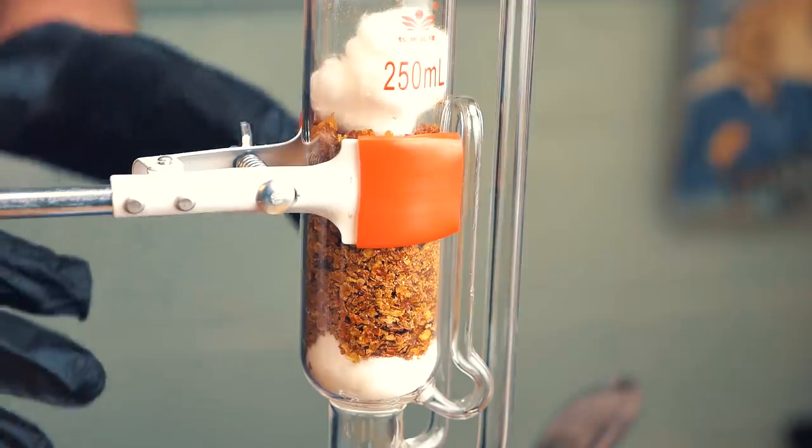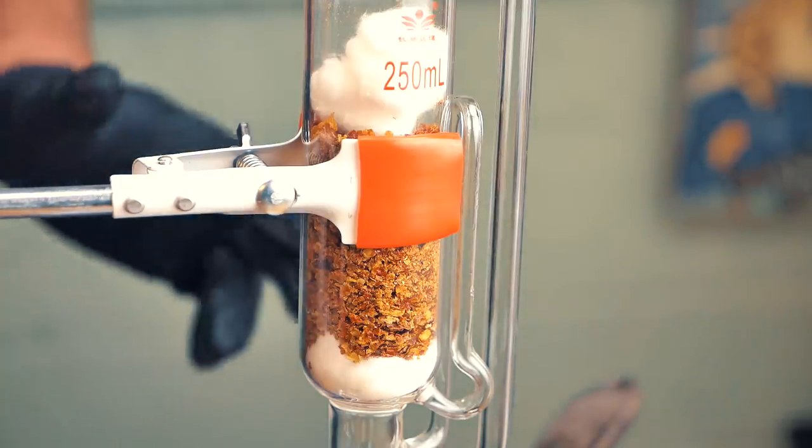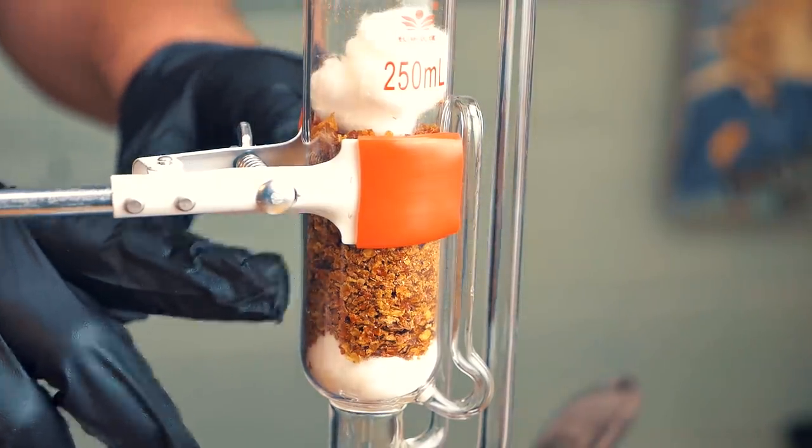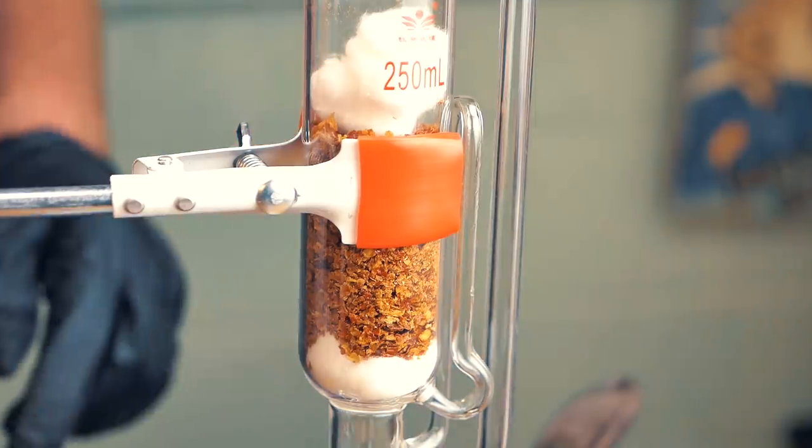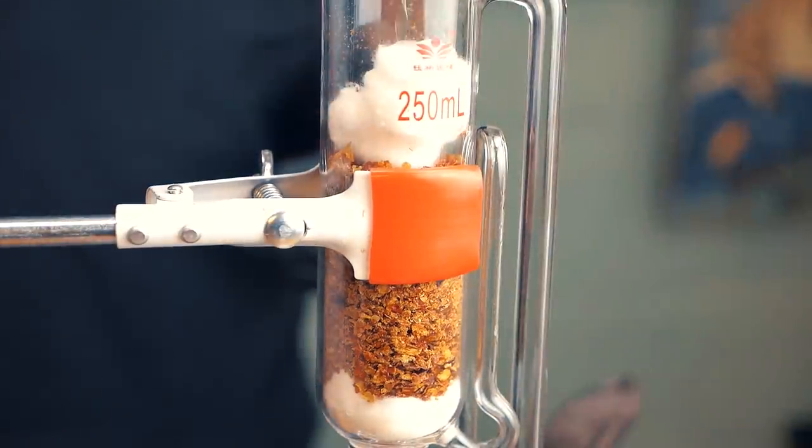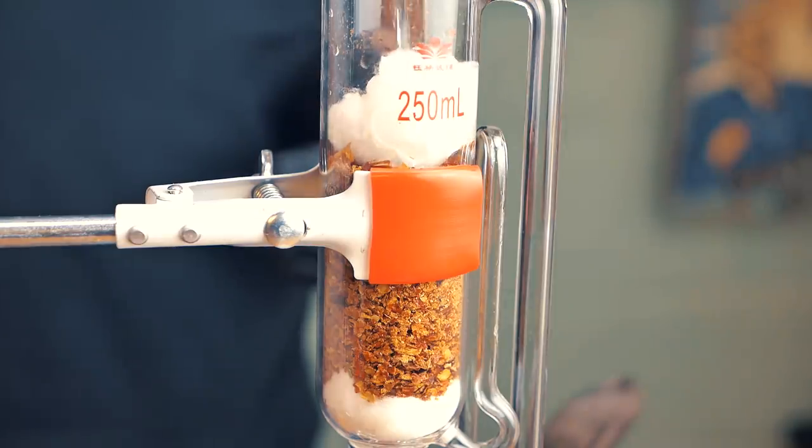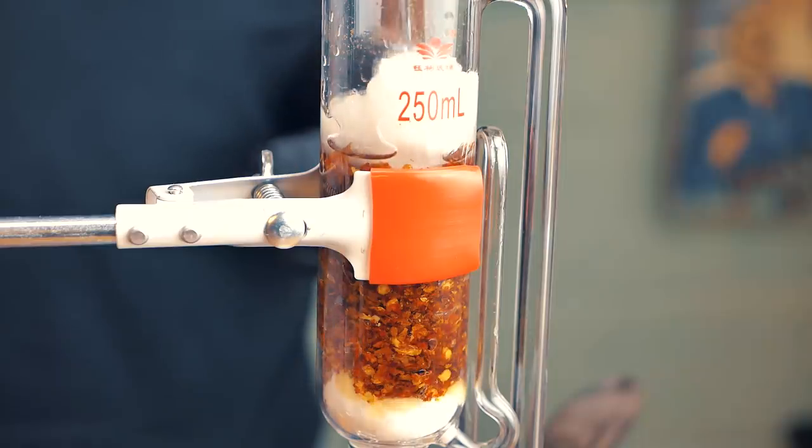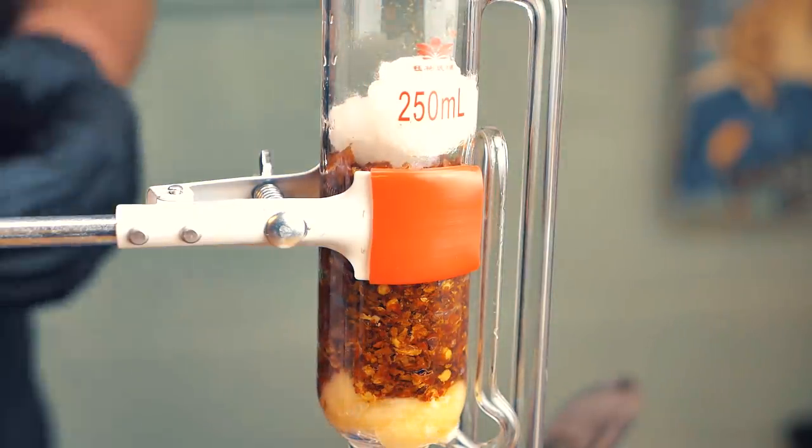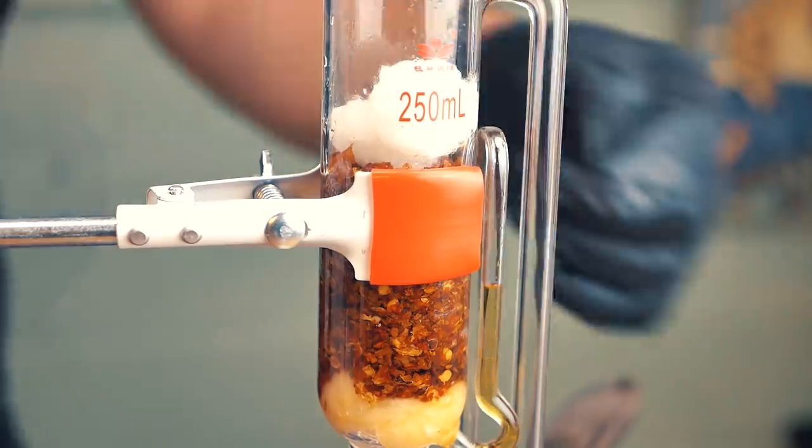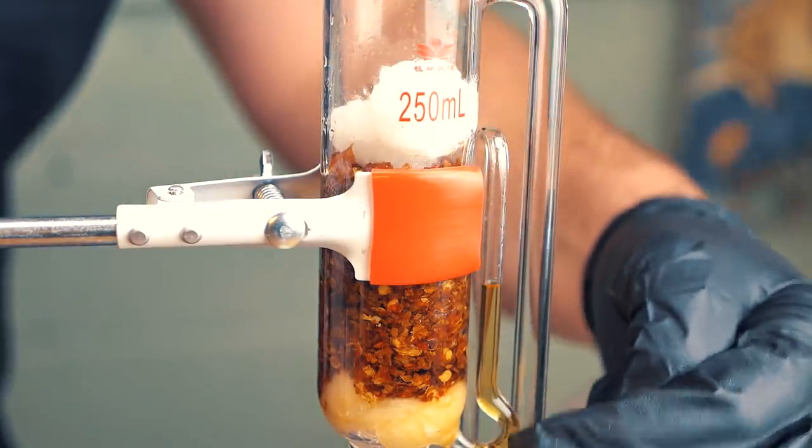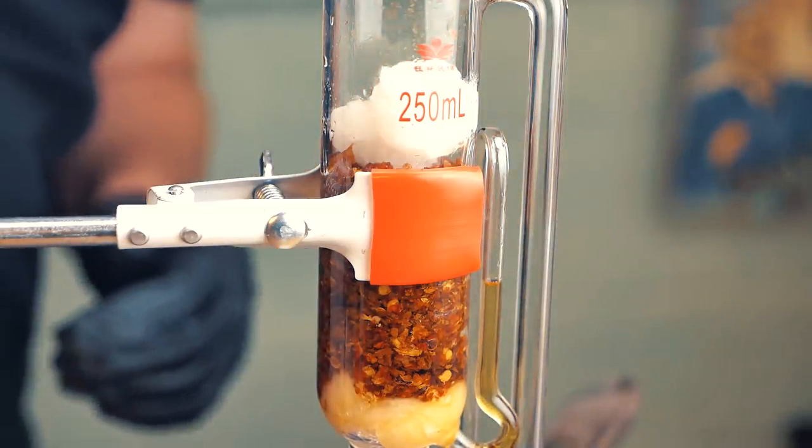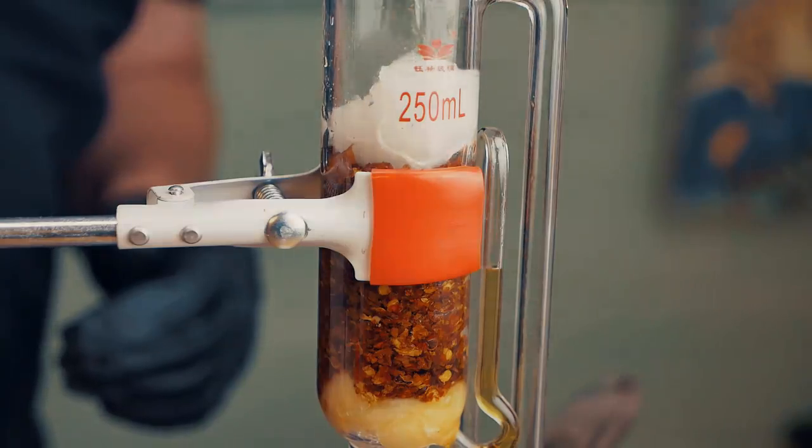For this extraction, we're going to use about 200 milliliters of ethanol, so I'm going to measure that out quickly, and we're going to pour some of it into the top here, into the Soxhlet extractor itself, and the rest we're going to pour down into the round bottom flask. We can see here that the ethanol is already starting to pull some of the capsaicin out of the peppers, so it's already starting its job, and I'm just going to fill this up just below the level of where the siphon would actually begin.